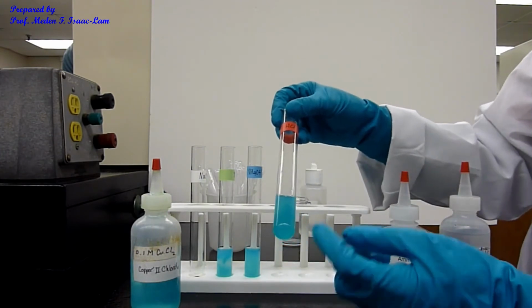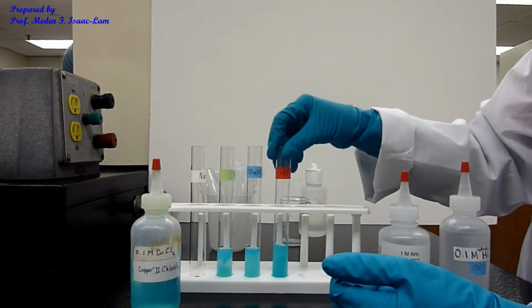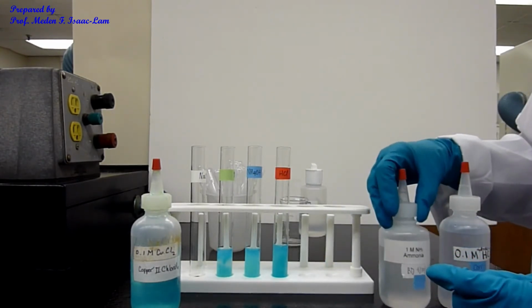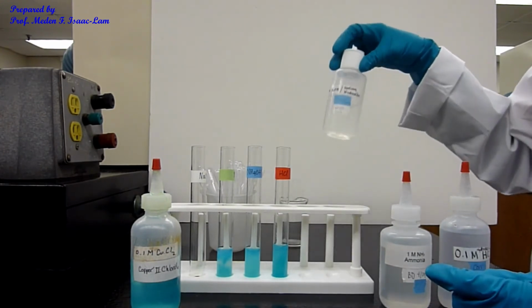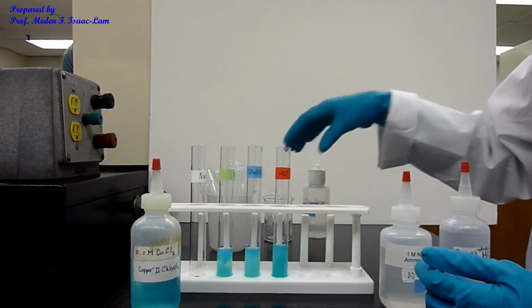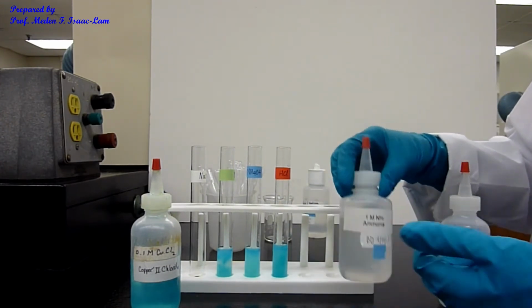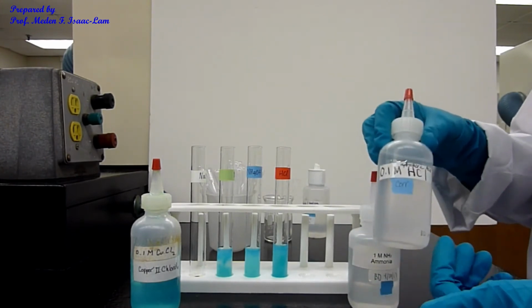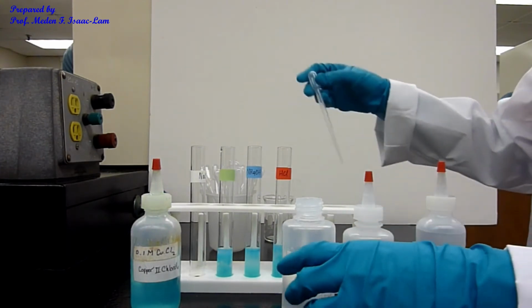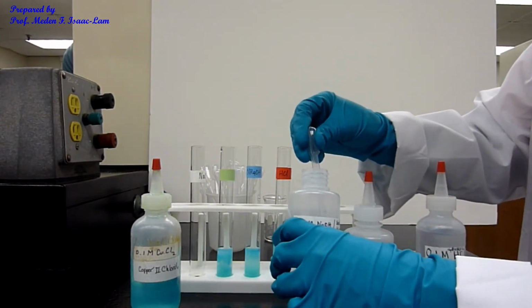So I just added this and it's already forming. Okay, so you see some solid at the bottom. So we're gonna see how it would behave if you add more of the base. And then what happens if we add ammonium hydroxide, and what happens if we add hydrochloric acid. So I'm gonna add additional sodium hydroxide, about this much, and then see how it works.